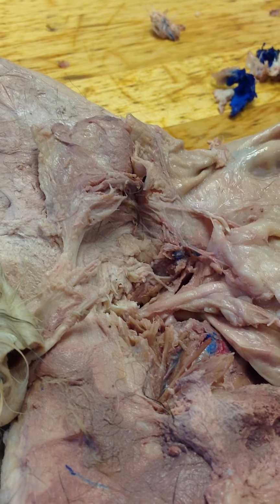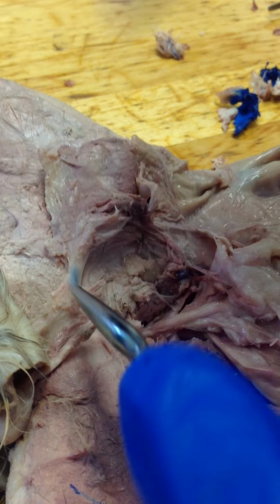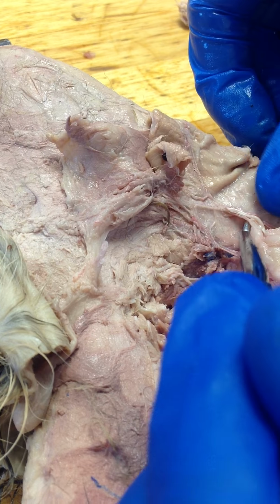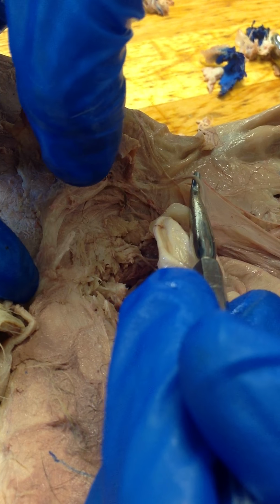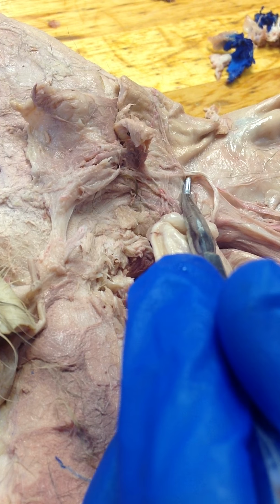It's been torn to shreds. Here's one part of the spermatic cord, and here's another inside the body cavity, and this part is actually outside. So the canal is where it would go through the muscle wall.